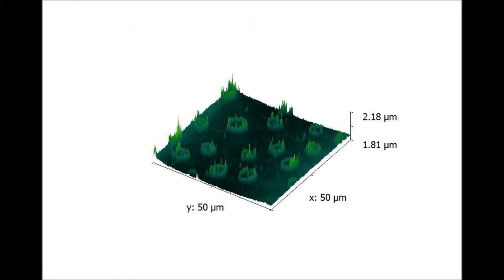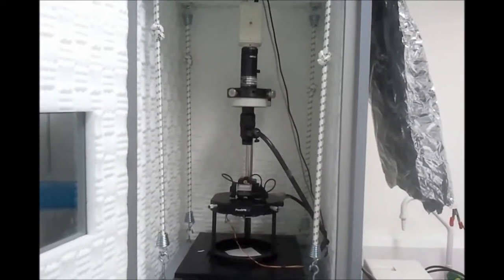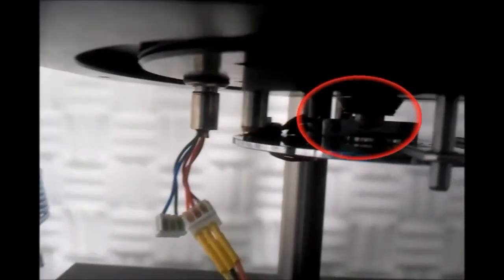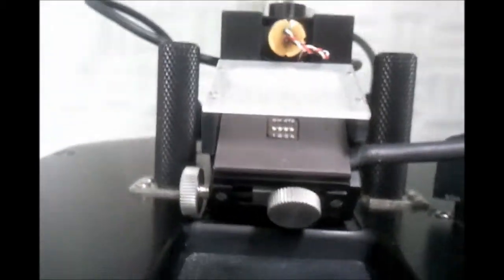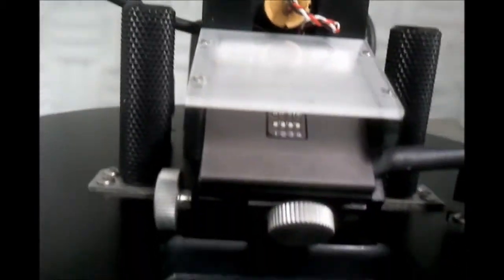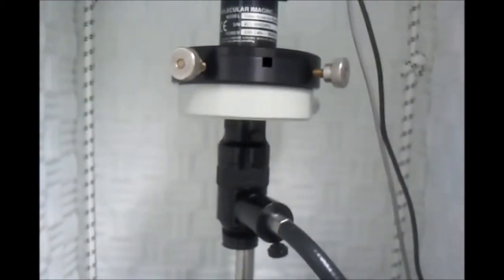This video shows a real AFM as used by students at Bristol University, England. This is the cantilever. This is the laser diode. And this is the quadrant photodiode, more on that in a minute. This is a video camera and microscope which allow people to see where the cantilever is in relation to the sample. This is the quadrant photodiode.